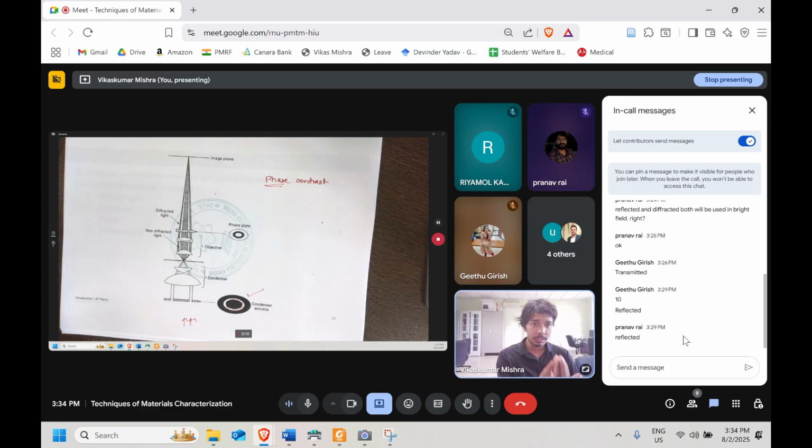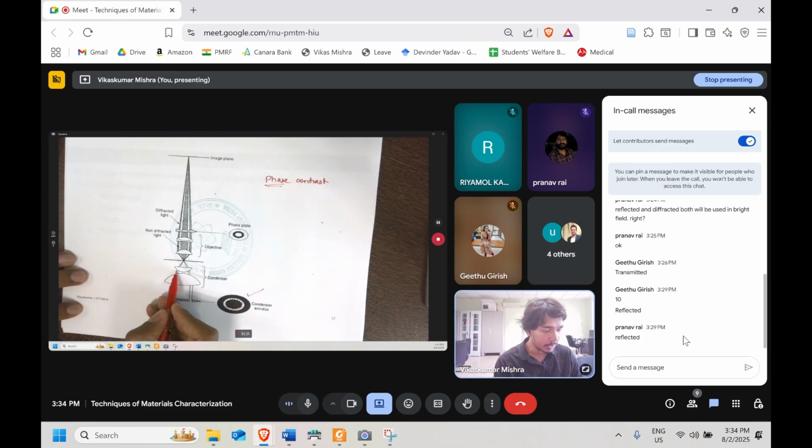Let's say we are placing the light; it will disperse in all directions. Now if you put a circular ring opening to it, it will go into a cone. It will form the cone. Inside is a block. So the path of the light ray is a hollow cone. Now that hollow cone is the one we can see.